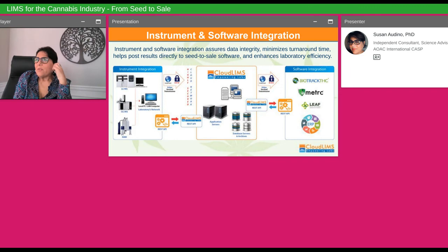I keep coming back to the word defensibility. And I think that we all agree that we're seeing more and more lawsuits come up, or more labs closing down because of failure to comply with certain requirements and regulations. Some of that may be about staff competence or laboratory competence, and maybe some of it is about record management and the integration and the compilation of all of the data that goes into this.